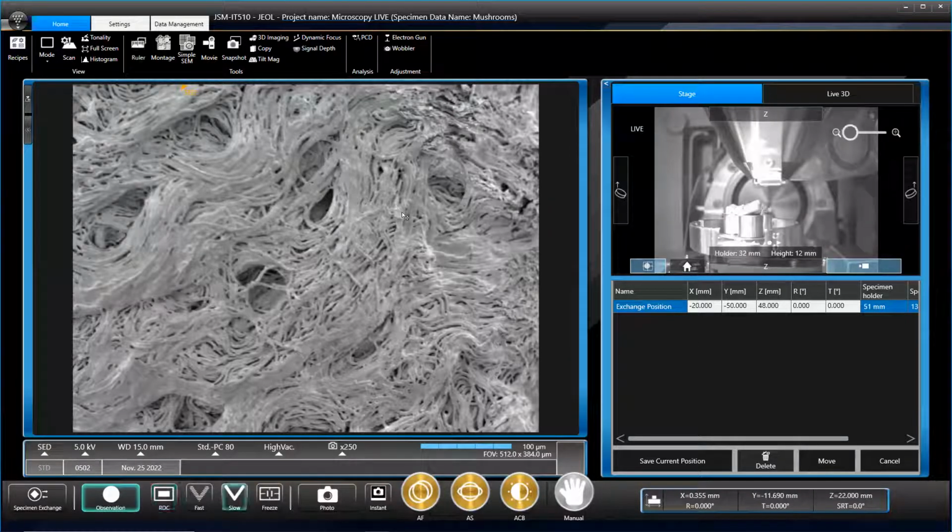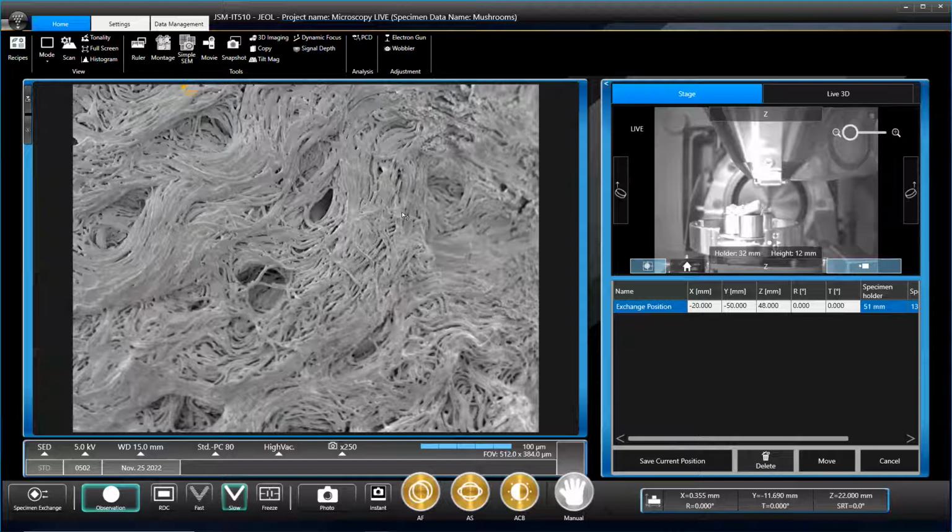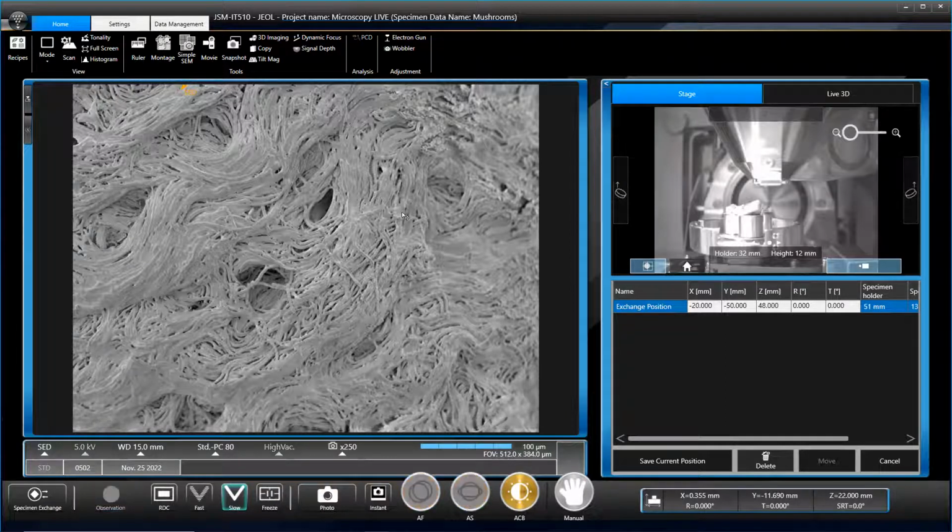So this is all the mycelial network, and each of those tubes is one cell thick. Oh wow. And so the mushrooms produce spores that land on the ground. It is sexual reproduction, but it's not male and female; they call it A and B, positive and minus. You get compatible hyphae meet, they then produce fertile hyphae and your mycelia, and that's what begins to pin and produce your mushrooms. So it's only if compatible hyphae meet that you'll actually get mushrooms being formed.